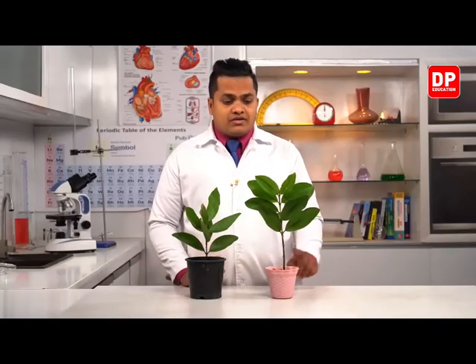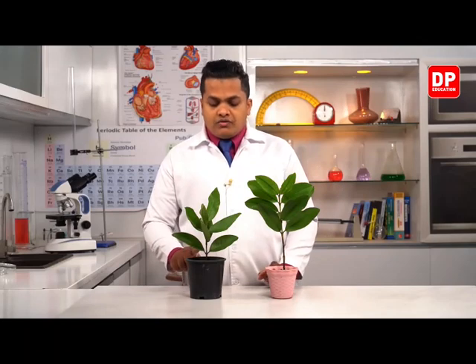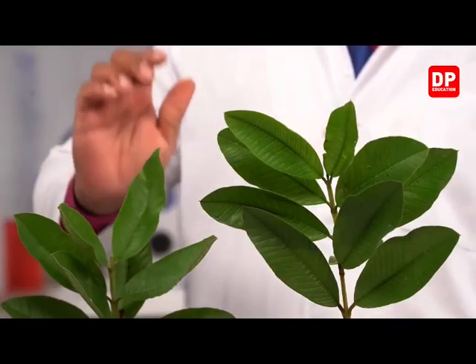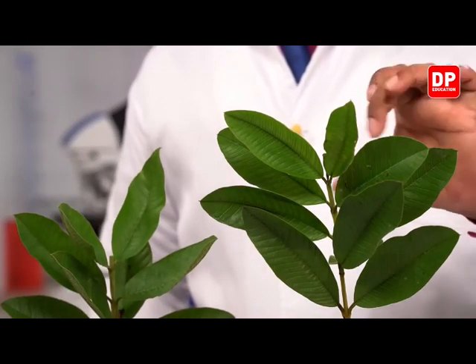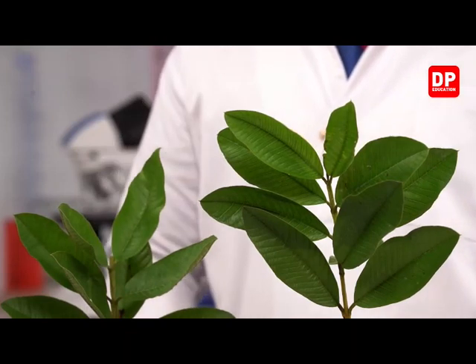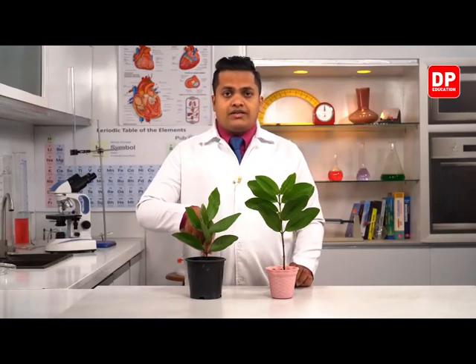So here the apex has grown, right? However, the plant whose apex was removed, the height of that plant is at the same level. This is slightly grown. However, the plant whose apex I have removed, the height of that plant is at the same level.